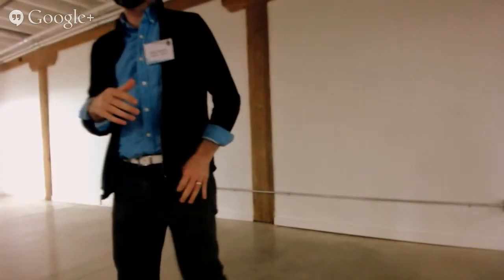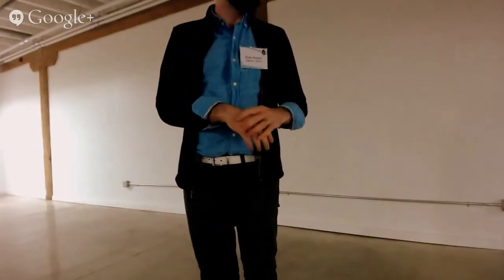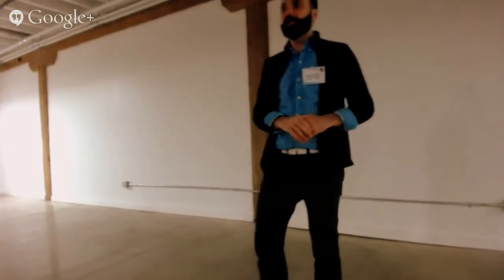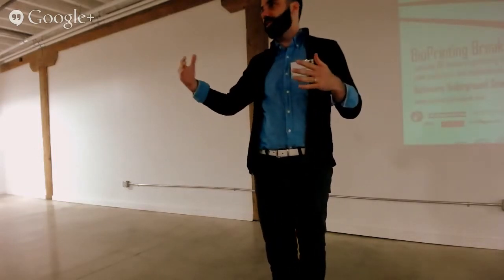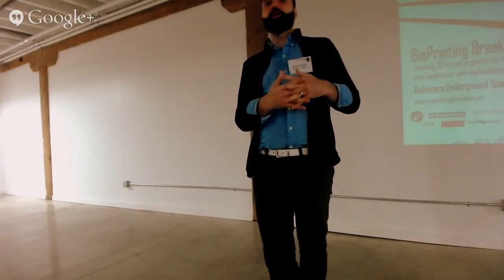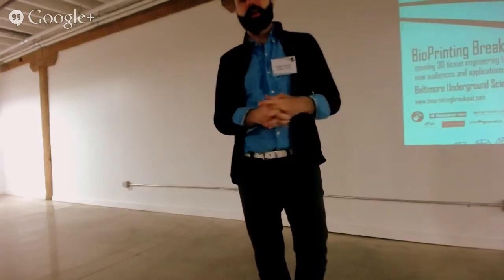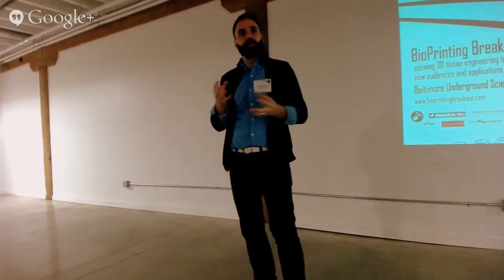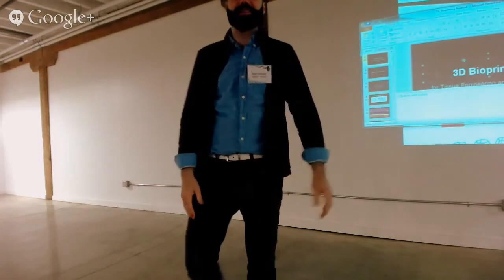Andy and I worked together. He was our technician at Mica. He actually worked for me at Mica, running the digital fabrication studio. And he's now at Rice. He's been working a lot at this intersection of open source hardware, open source 3D printing, and tissue engineering. In the lab where he is now at Rice, that's run by Jordan Miller, who's been doing a lot of interesting work, again, at that intersection. So these guys here are for Jordan's work.